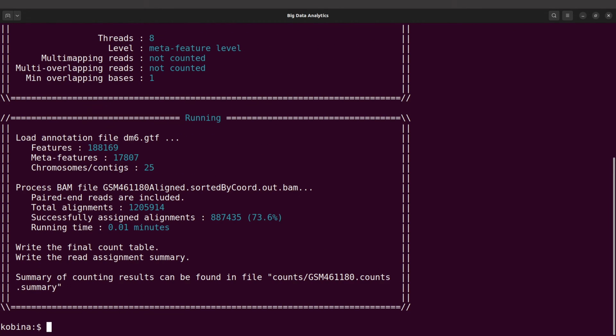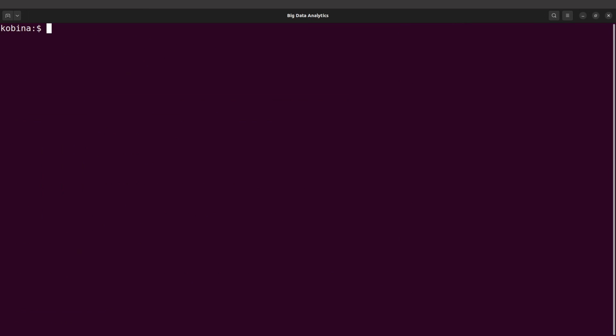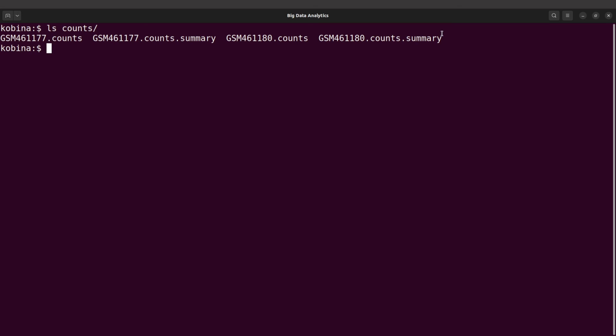Perfect, that has also been done. So let's clear the screen. Let's ls into count, and we are going to find that one also here. All right, so we have them also here.